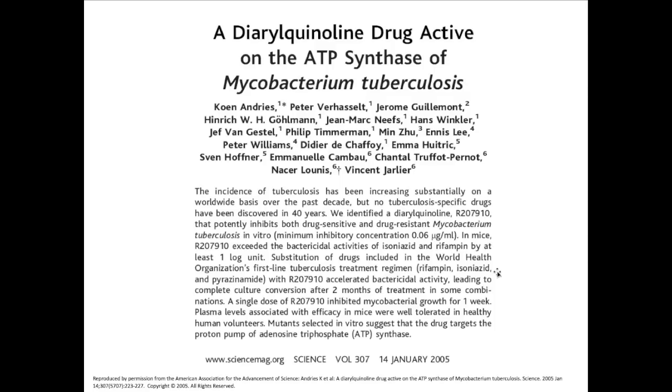Now I'm just going to talk a little bit about some applications of this technology to some interesting areas of biology. This is a paper that came out a while ago, 2005, but I think it was a great example of how you could do experiments that would just not be as easy without the power of the high-throughput sequencing methods. This one was done with a 454 instrument, but the basic story was that this group had identified a new antibiotic that seemed to kill Mycobacterium tuberculosis quite well. And they wanted to figure out what is the target of the drug inside the cell, what proteins or what other areas of the cell it is attacking.